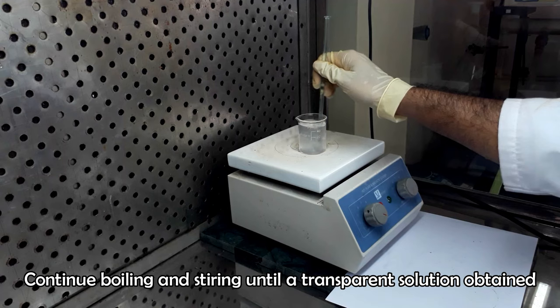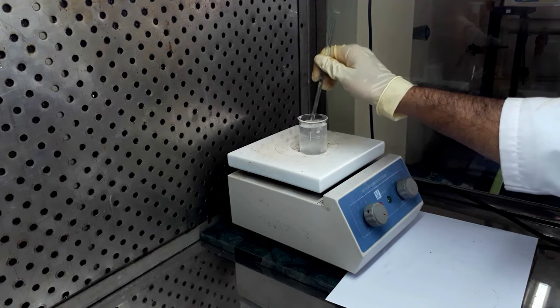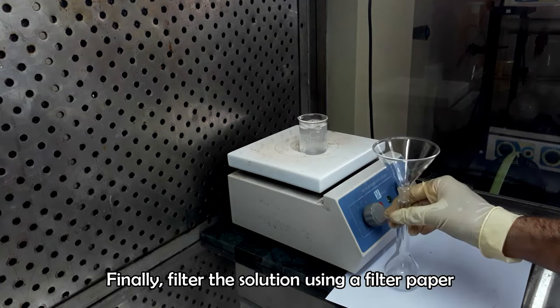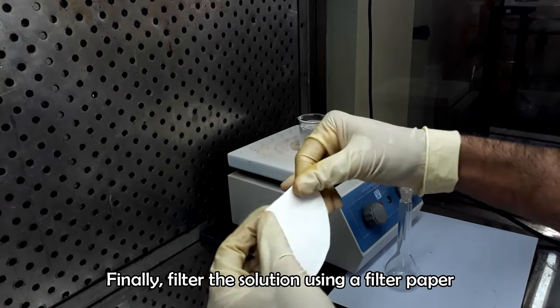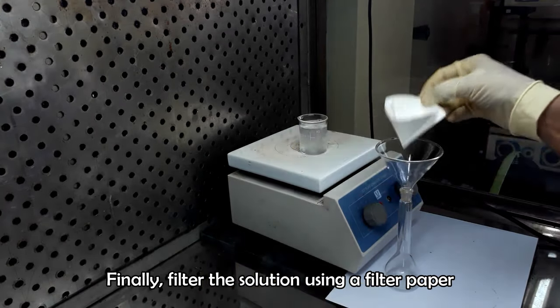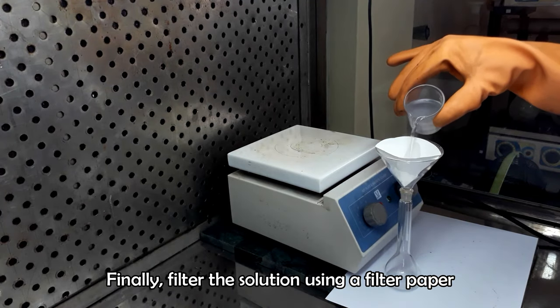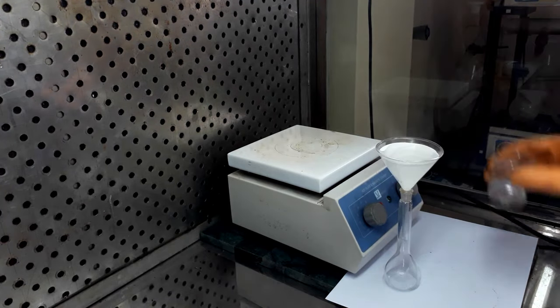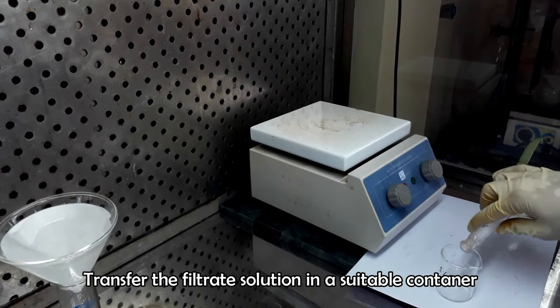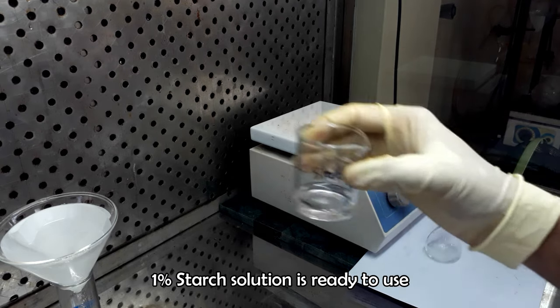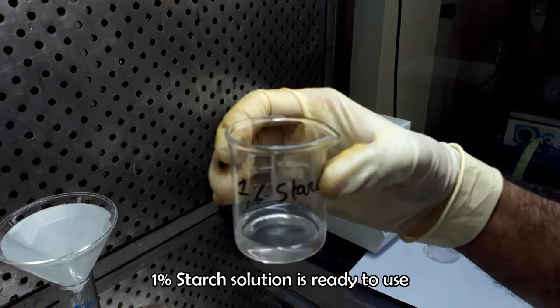Clean and transparent solution indicates that the starch is dissolved in water completely. After dissolving the starch, filter the solution immediately using a filter paper. Collect the filtrate and use it in the test as 1% starch indicator.